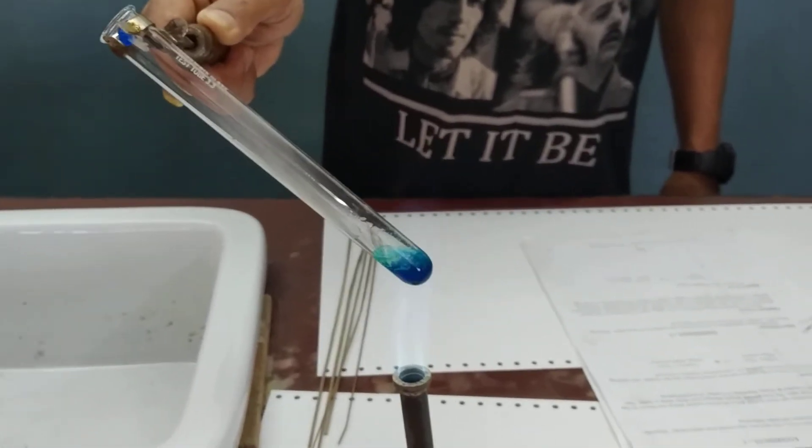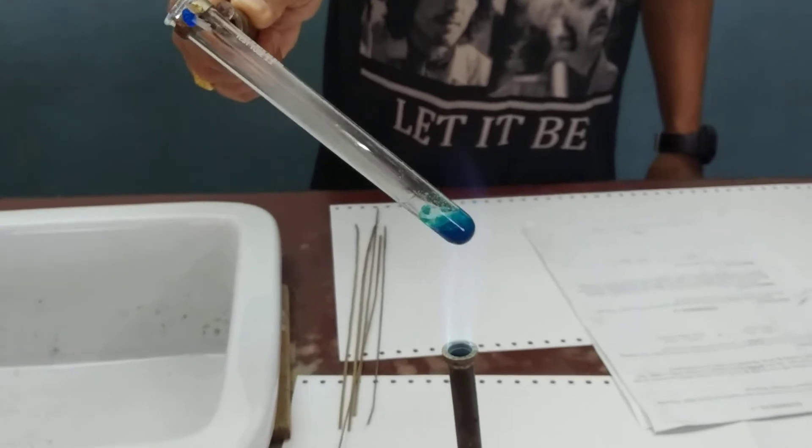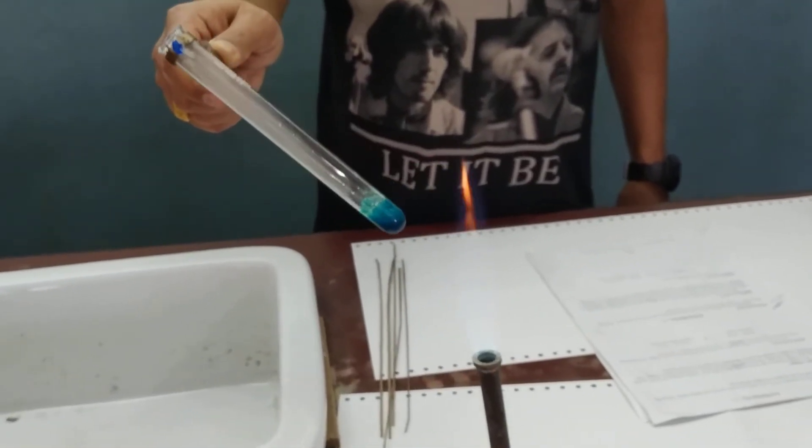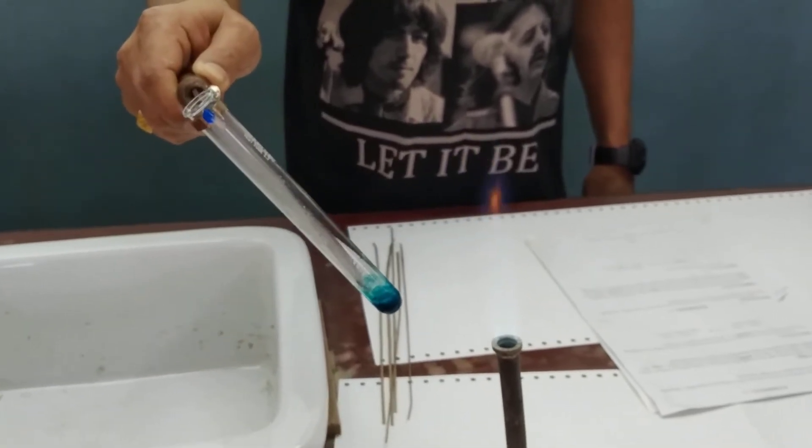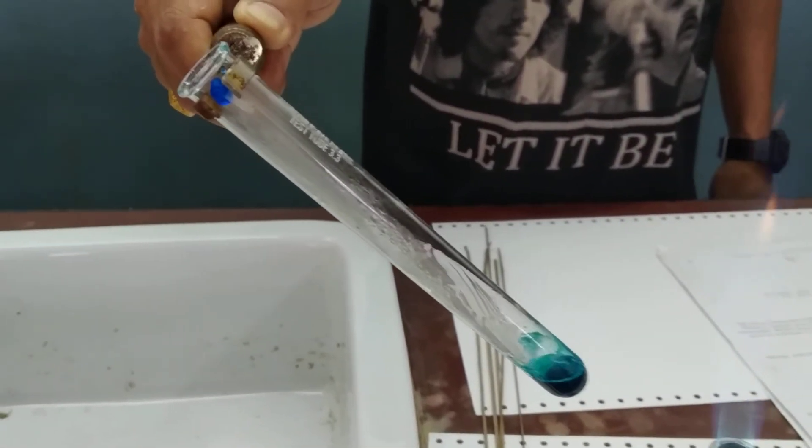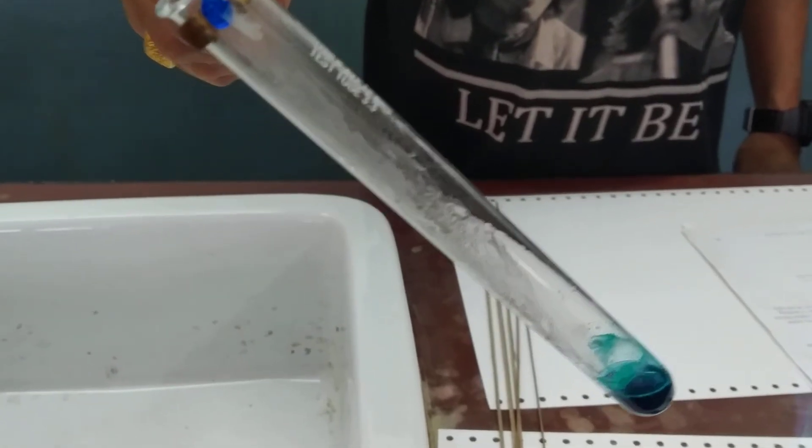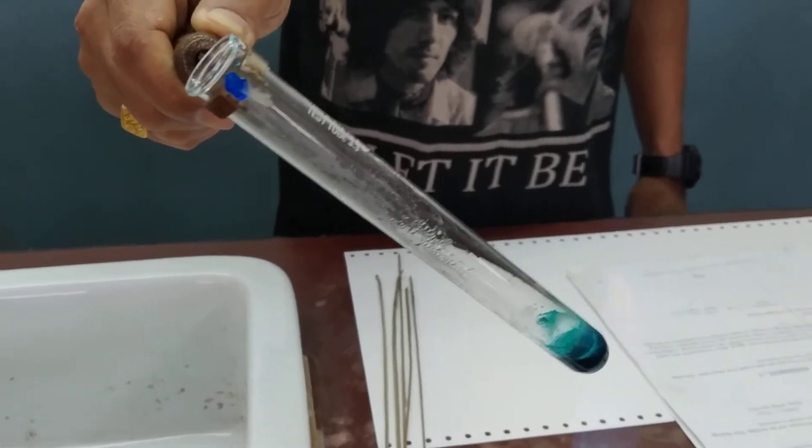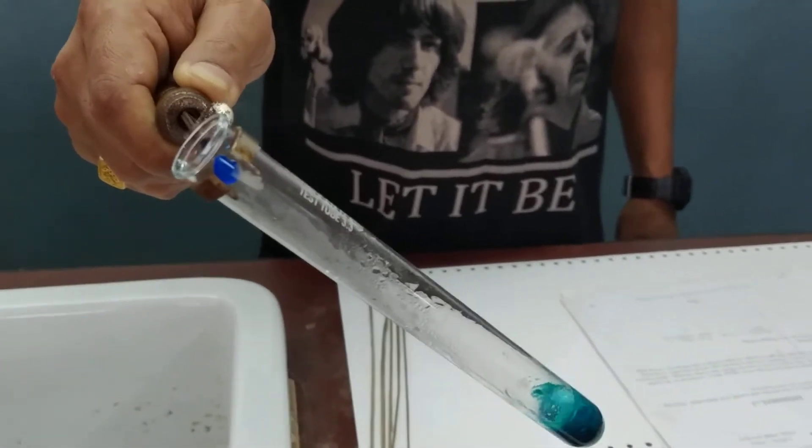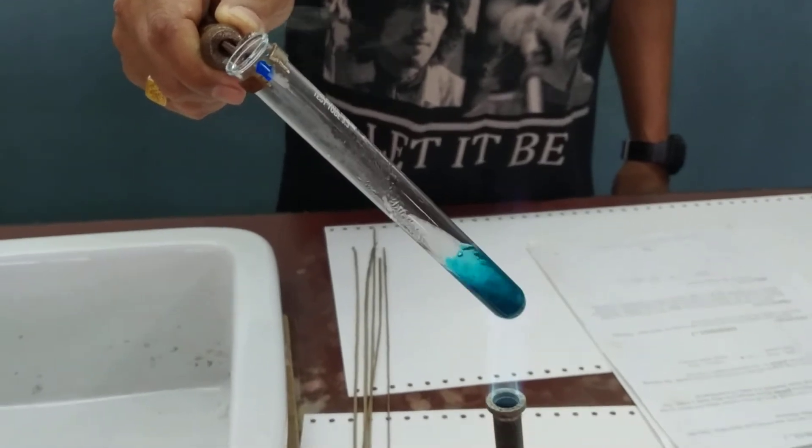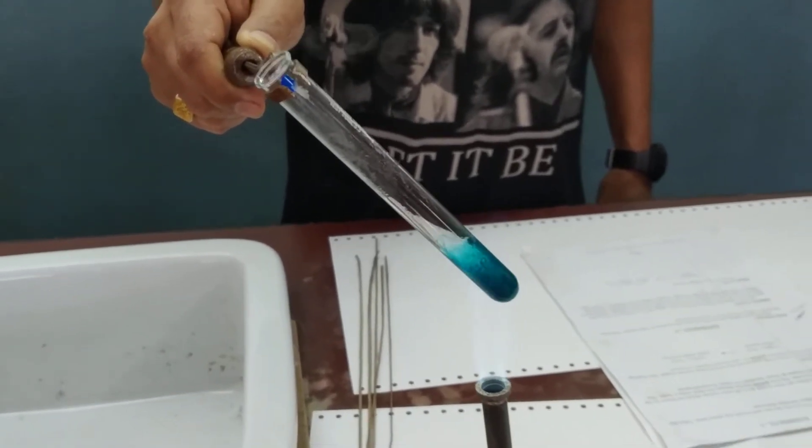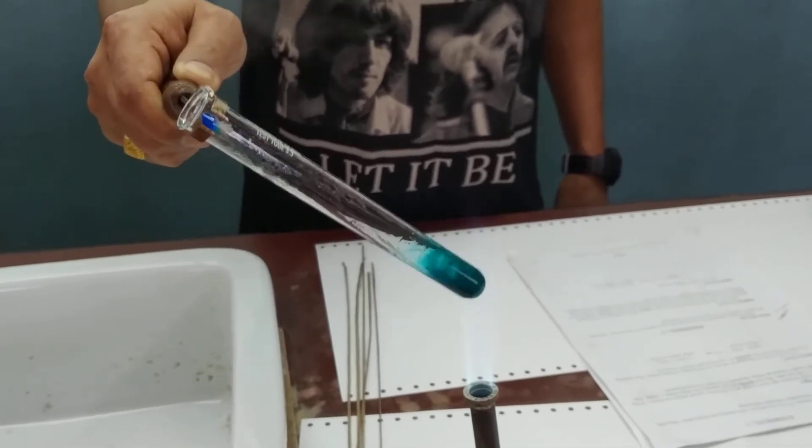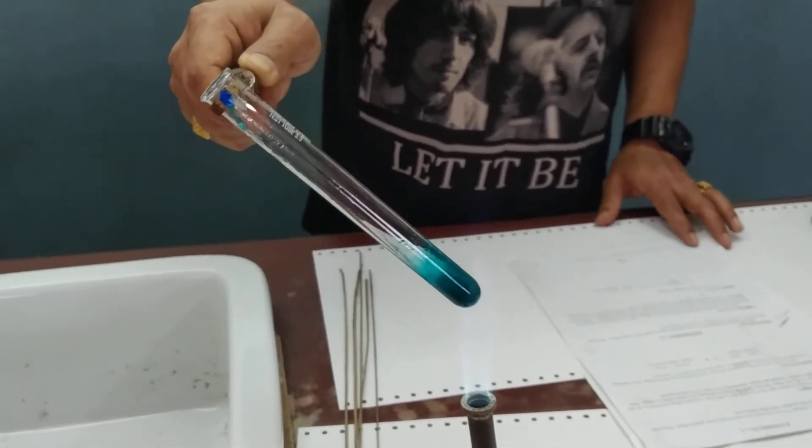We observe that the blue crystalline solid has melted and is releasing water of crystallization. You can see water droplets in the cooler parts of the test tube. If we heat it excessively, vapor comes out of the test tube. These droplets are water of crystallization.